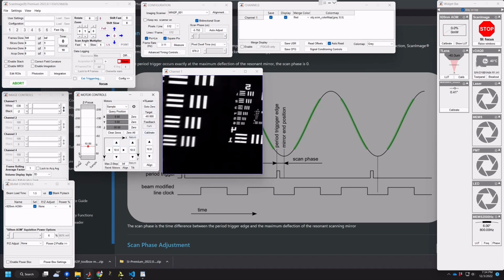This is reflected on these left axes here, but as our sample position with the stage is in combination with the microT lens, our resultant sample position is 10.